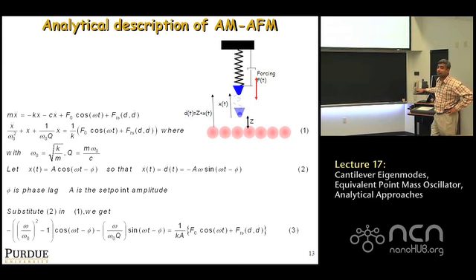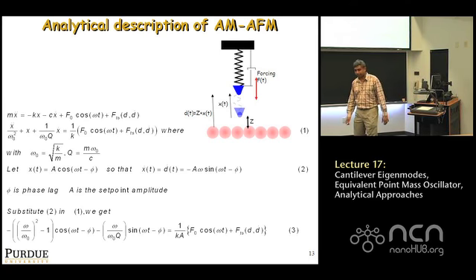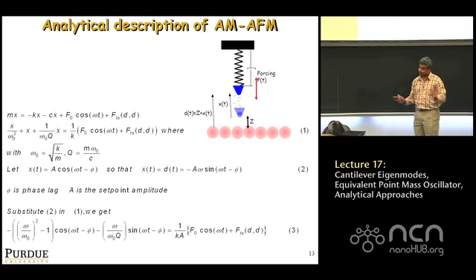Yes? As an experimentalist, when you measure the phase in your AFM system, what is the simplest technique you can use to determine whether the system is giving you the phase lead? Okay, very, very good question. It's a very important thing. How, as an experimentalist, do you know whether your AFM system gives you phase lead or phase lag?